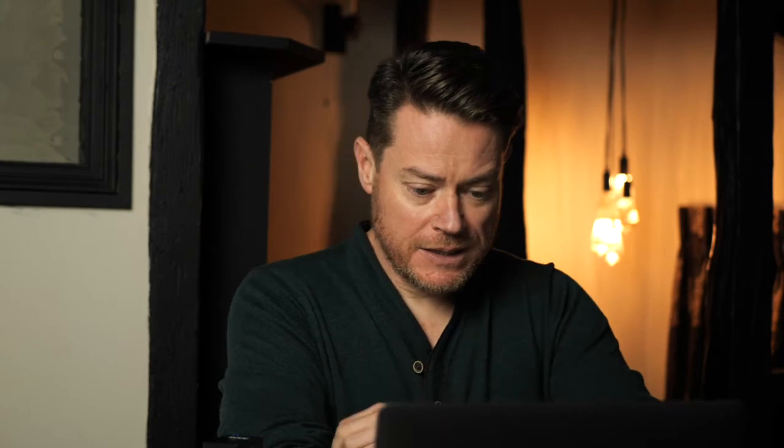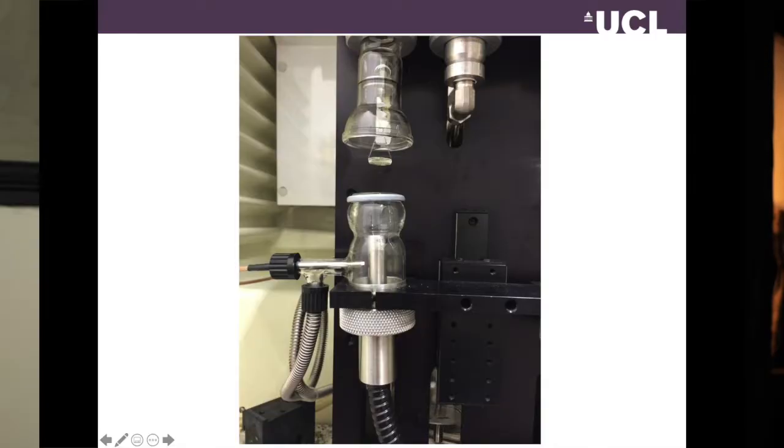The NIR itself is laser-based and just connects to the instrument with a fibre optic cable. On screen is a photograph of the actual instruments in the lab. The black section in the centre is the DVS instrument itself; the balance mechanism is in the dome at the top; the two glass chambers on either side are where humidity is controlled; and the black cable snaking away from the bottom left is the fibre optic cable carrying the NIR laser. The spectrometer is mounted on top. The NIR probe comes in from the bottom and the flat-bottomed quartz pan sits at the top.